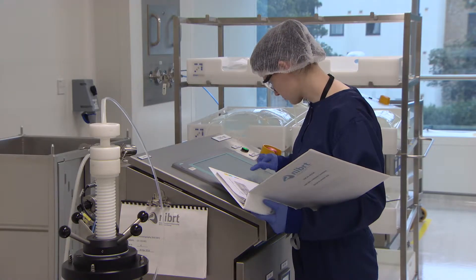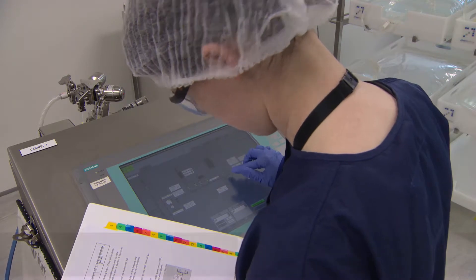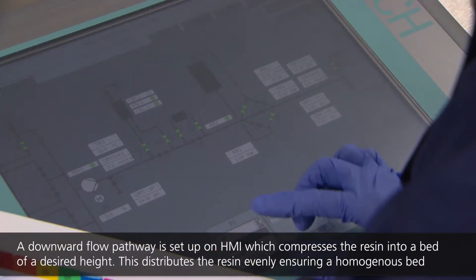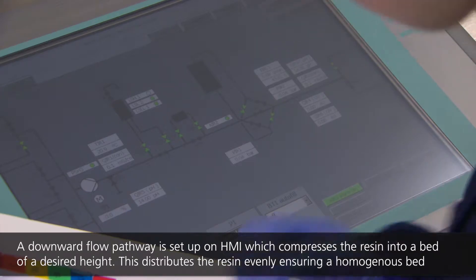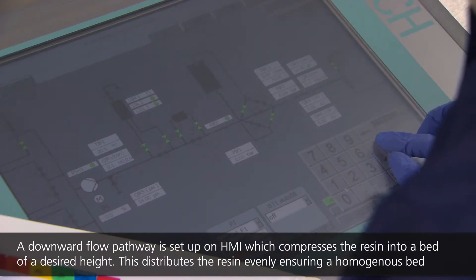For the column packing operation, buffer is pumped through the top bed support under pressure. The pressure packs the slurry until a homogeneous resin bed is achieved. The operator begins the packing process by pumping buffer from the inlet connection at a defined pump rate or pressure value. Pressure is monitored by gauges along the fluid pathway, which continuously report values back to the control system.